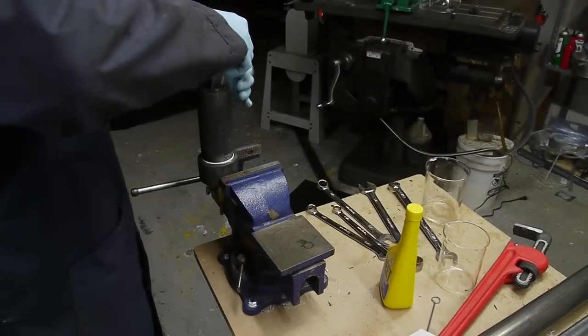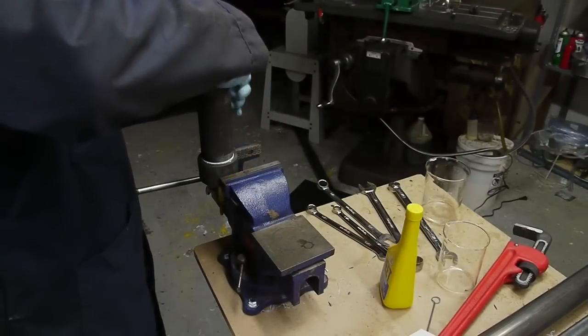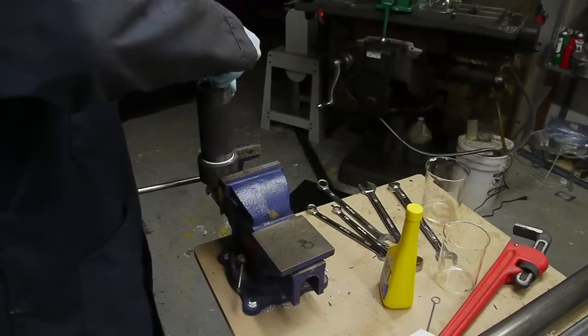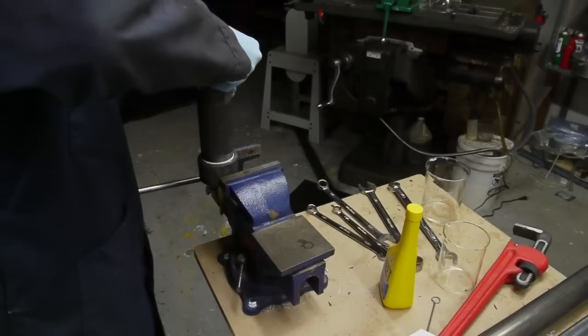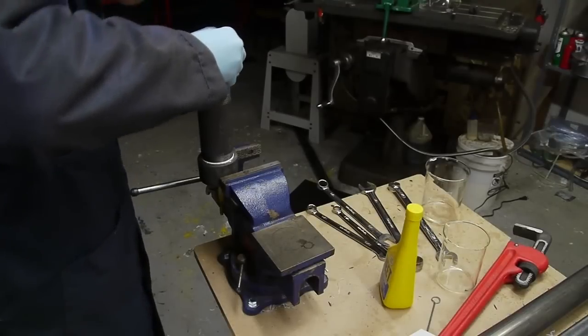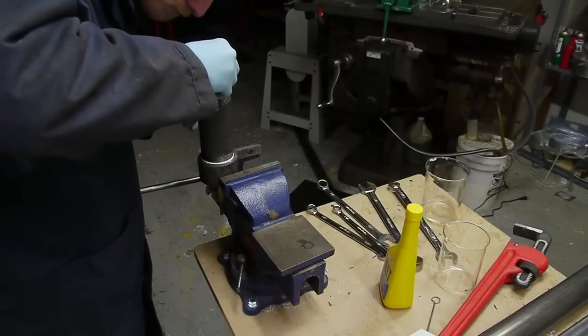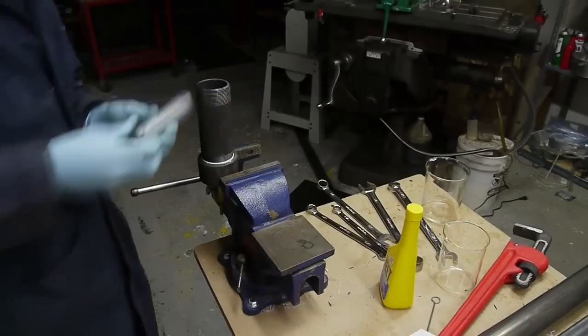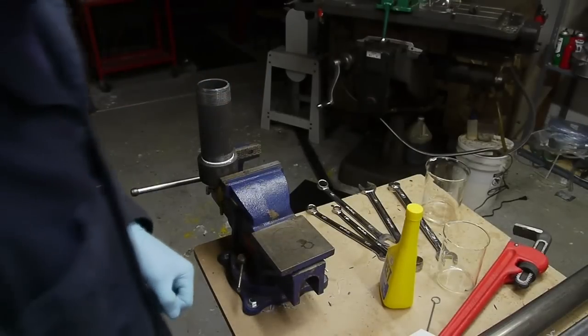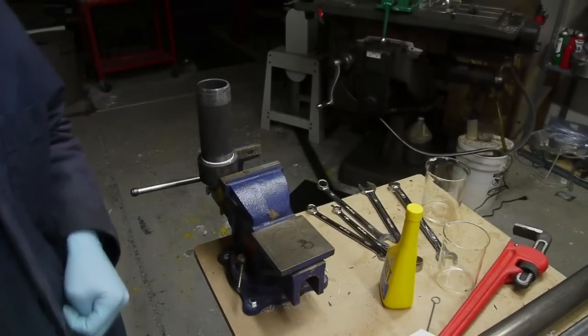But the lower density aerogel just cracked apart, kind of as usual, as I was ejecting them from the syringe. So I think in the future, if I try another batch, I will use like a metal container to form the aerogel and then put the whole metal container inside the drying chamber so they don't have to unmold it.